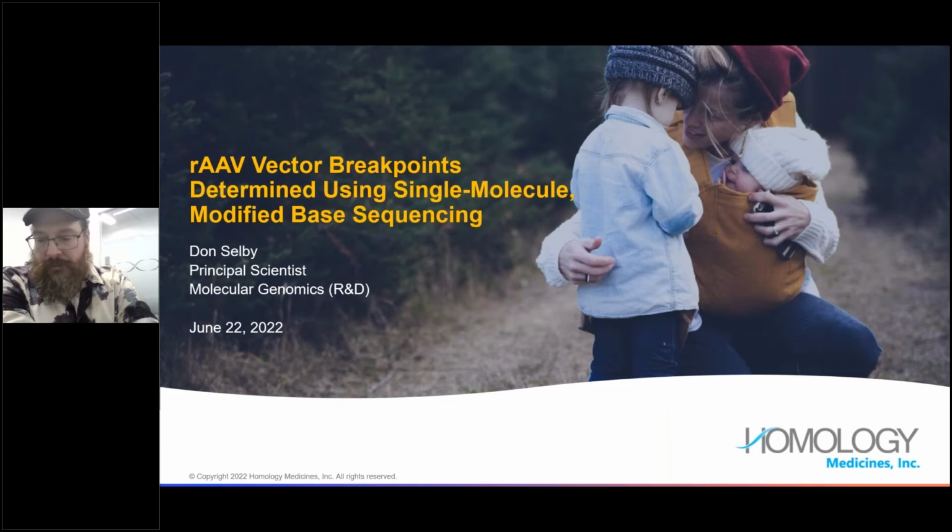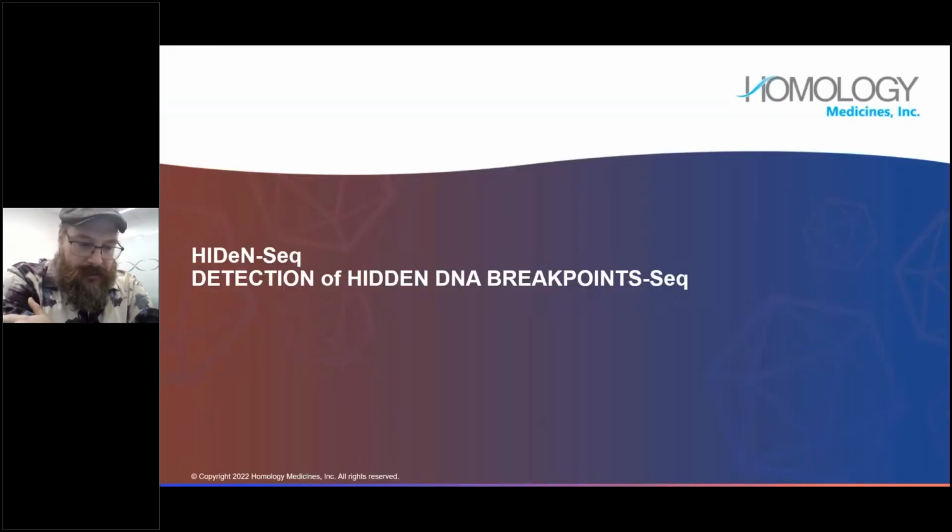So we've come up with a means to identify where our vectors, as Liz was alluding to, have these mystery phenomena where you will want to package something into a capsid and it does not get fully encapsulated. And you really normally won't have any idea exactly contextually where it's breaking, what's problematic, what you need to rectify, and what could be actually causing this pattern you would see.